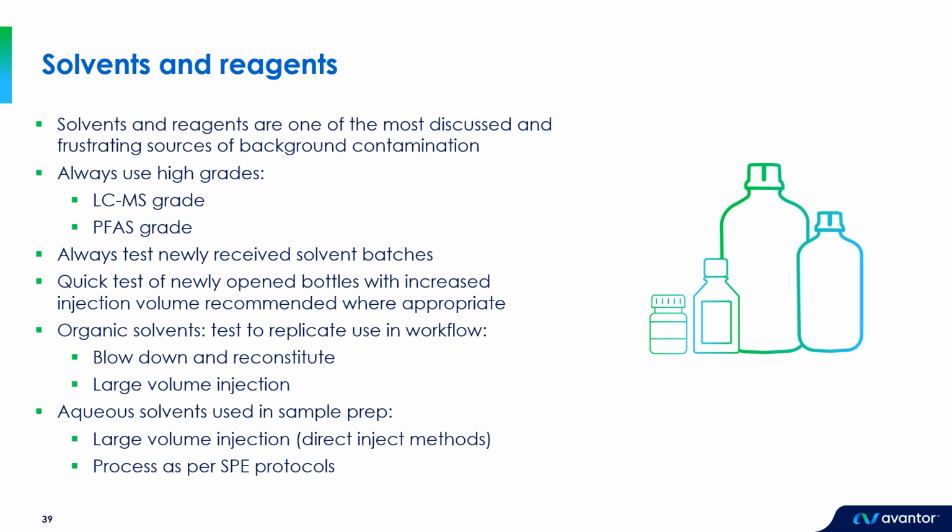So the recommendation is, of course, to always test newly received solvent batches before using them. Personally, I tend to do a quick test of any newly opened bottle with an increased injection volume, just for my own assurance that the new bottle's clean. In terms of testing organic solvents, again, we need to test to replicate their use in the workflow.